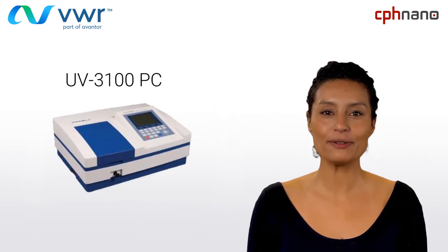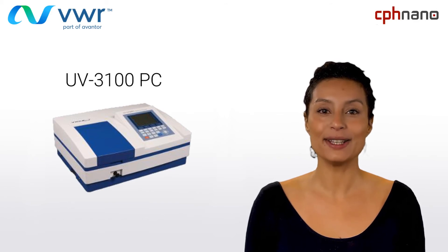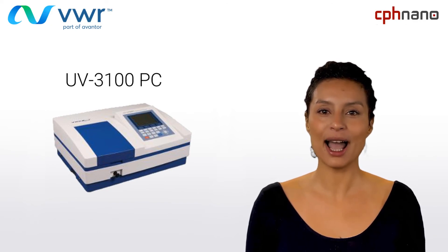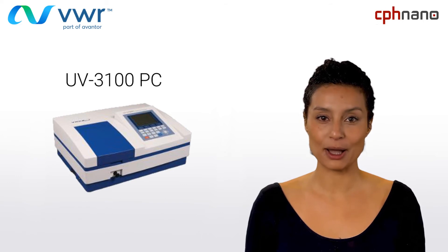A more powerful and flexible instrument, the UV3100PC is ideal for advanced measurements. Just like its little brother, the UV1600, this instrument is reliable and easy to use. However, it has a wider wavelength range, a higher accuracy and comes with a variety of accessories that will help the user personalize the instrument.